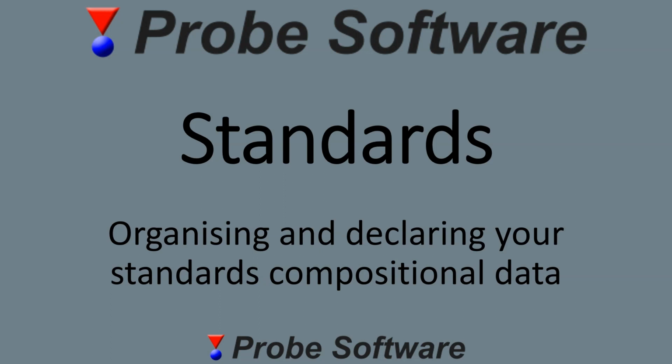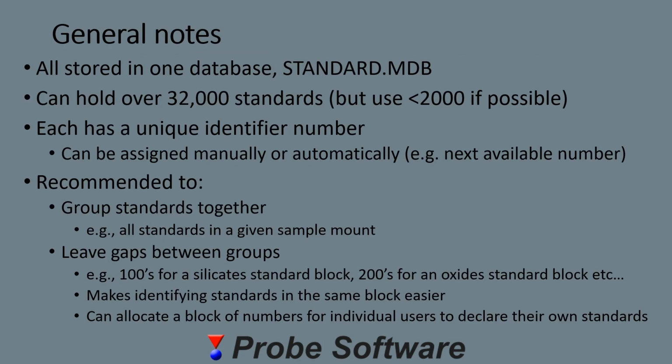In this short video, we're going to look at how and where you organise and declare your standard compositional data. Before we actually launch the software to do this, let's go over some notes. Now, all of the data is stored in a single database called standard.mdb.